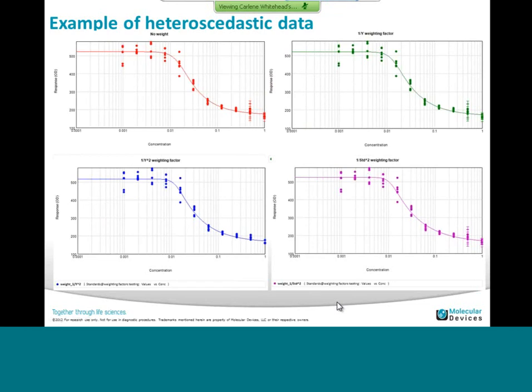Looking at those 4 graphs, it is not as easy as before, because there are so many possibilities for the curves to go through the points. I just cannot say which curve is best just looking at those curves.